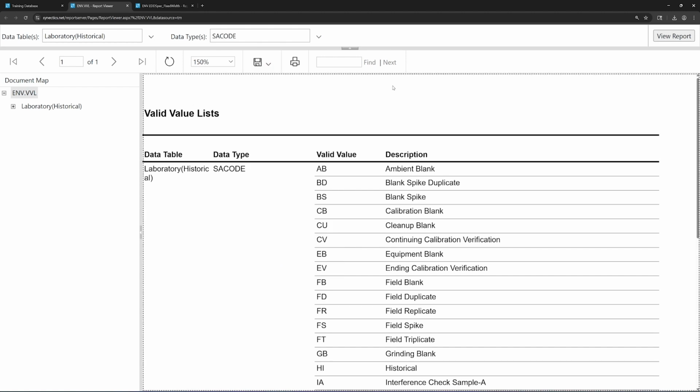Along with using valid values to create your EDD, you will need to make sure to use the location IDs and sample names provided by the contractor on the chain of custody. The contractor will enter the sample IDs into a chem field file in the database, which is a digital version of the COC. If there is a mismatch between the sample ID they use and the sample ID you use, you will get an error. If handwriting is unclear, reach out and confirm the sample ID to avoid running into errors later on.